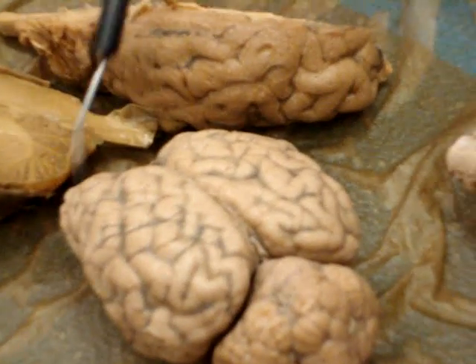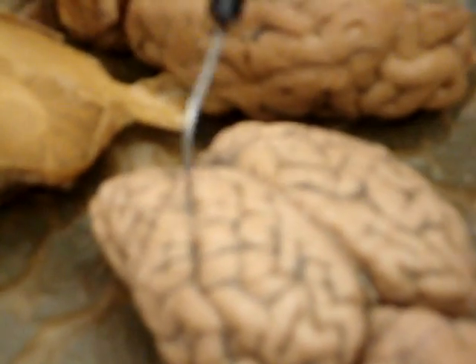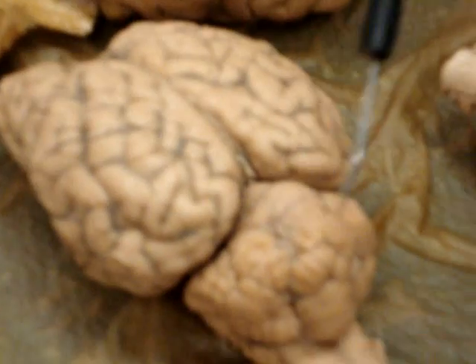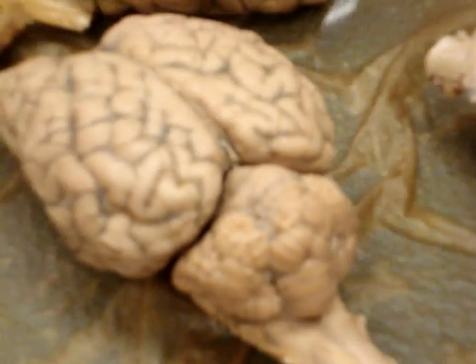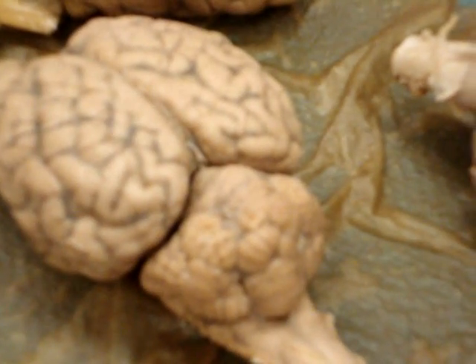So then what lobe is this? That's correct. Frontal. Then what lobe is this? Parietal. What's this over here? Cerebellum. That's the cerebellum. That one line is this? Transverse. Then what lobe is this? Occipital. See how smart you are?